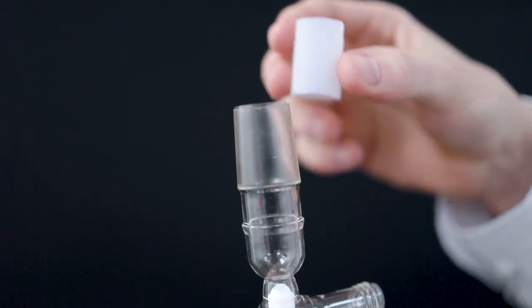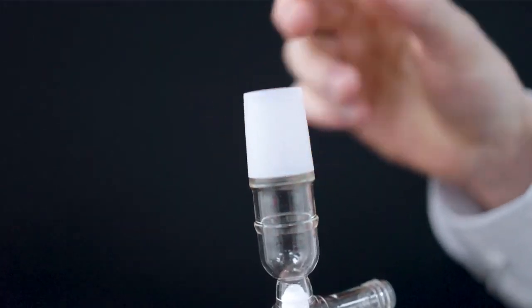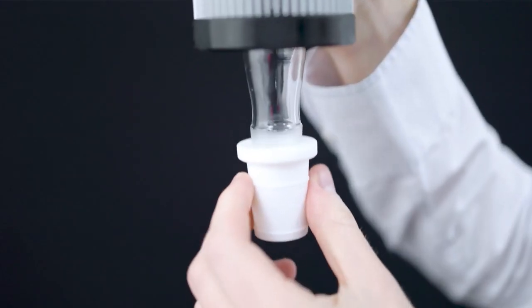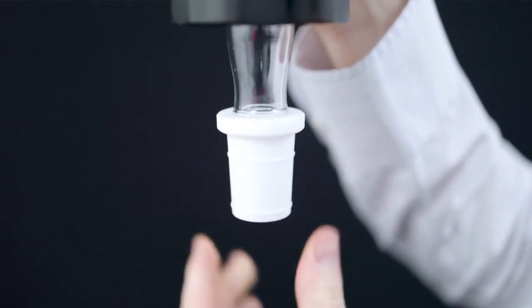A PTFE adapter or sleeve can fit between the socket and cone to try to prevent sticking. The adapter can also protect your joint from potential chips or breakage. These tips should minimise the chance of your glass joint sticking, but the issue can't be completely prevented.